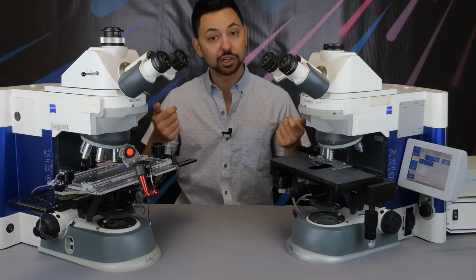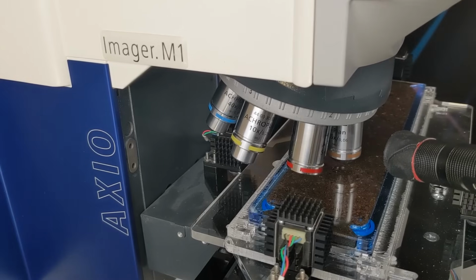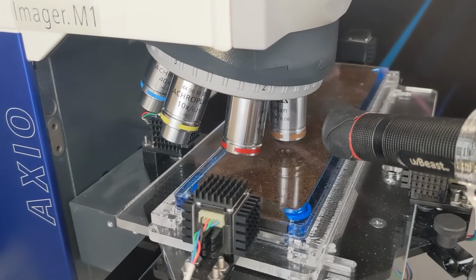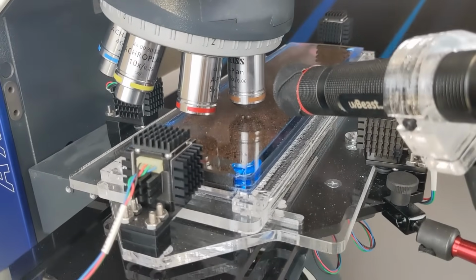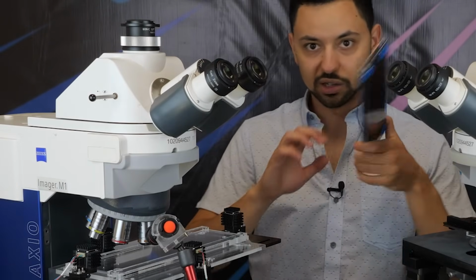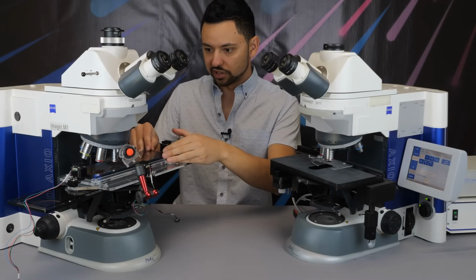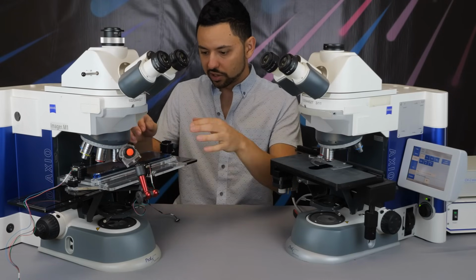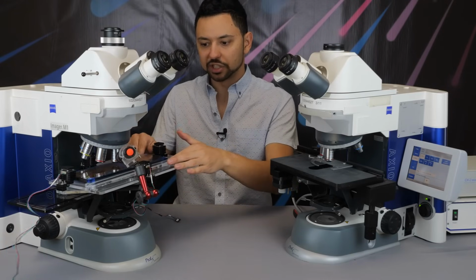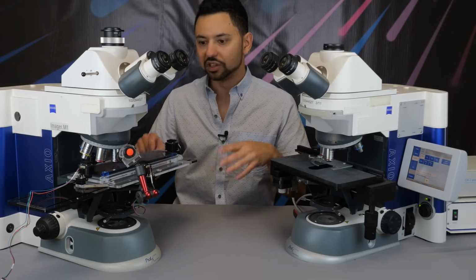So some of the modifications I made for this microscope setup are that, number one, I made a custom XY motorized stage that is specifically designed to house one of my standard Micro Safari cartridge sizes. So that slips in over here like so. And now it's on a motorized stage. Obviously, I can't run it because all the wires are unplugged at the moment, but you get the idea.